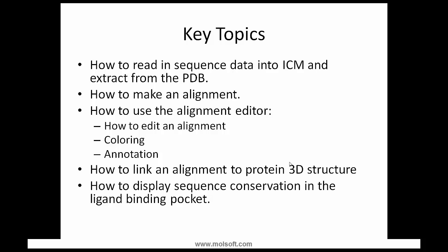The key topics of today's webinar are how to read sequence data into ICM and extract sequences from the Protein Data Bank from a 3D structure. Then how to make an alignment, and how to edit the alignment manually, tweaking the alignment, and also coloring, annotation, making images of an alignment for publications, and how to link an alignment to protein 3D structure, and then how to display sequence conservation in the ligand binding pocket, linking the protein structure to 3D.